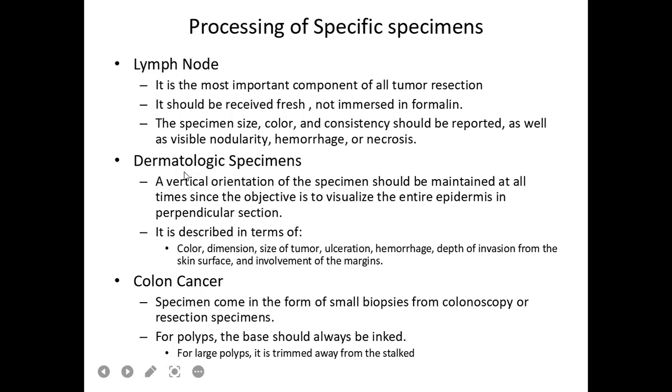For dermatologic specimens, a vertical orientation of the specimen should be maintained at all times since the objective is to visualize the entire epidermis in perpendicular section. It is described in terms of color, dimension, size of the tumor, ulceration, hemorrhage, depth of invasion from the skin surface, and also involvement of the margins.